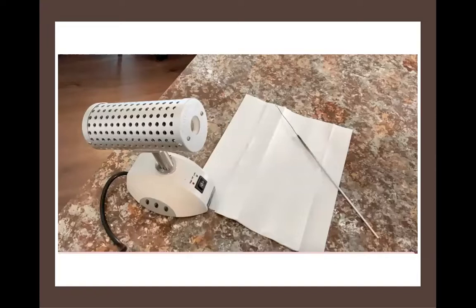Set up in the workspace here, there's an incinerator that's been plugged in and is nice and hot. And there's an inoculating loop. The inoculating loop must be sterile because you would never lay a contaminated inoculating loop on the desktop like this.